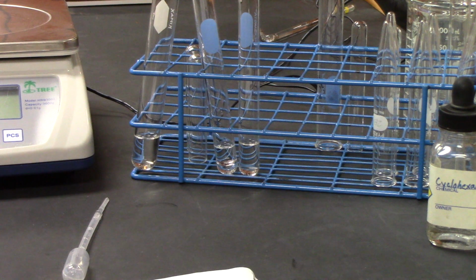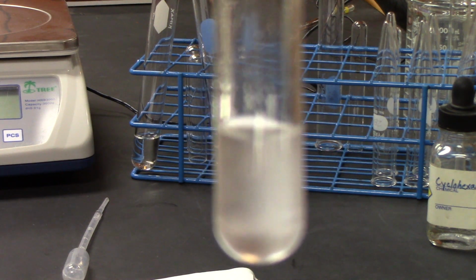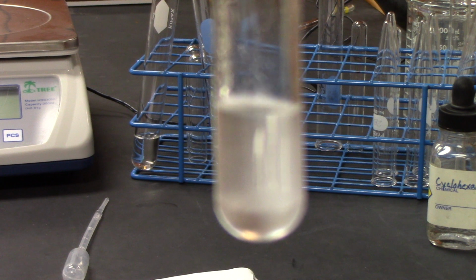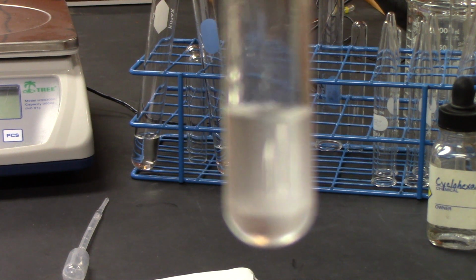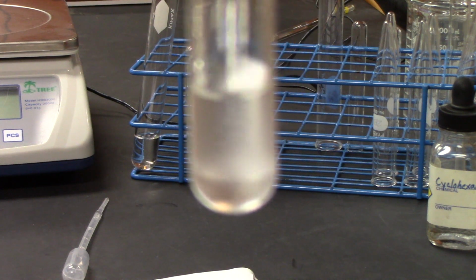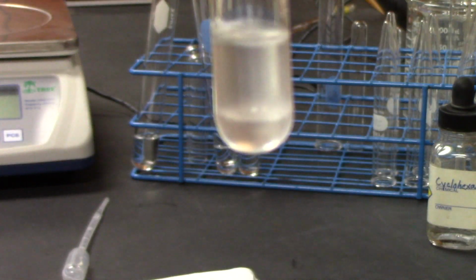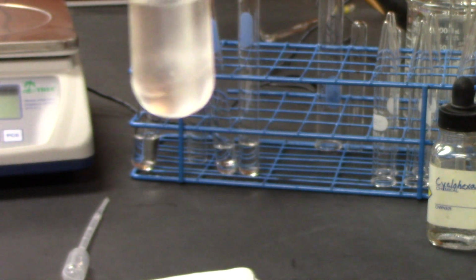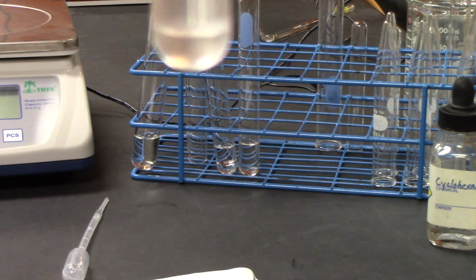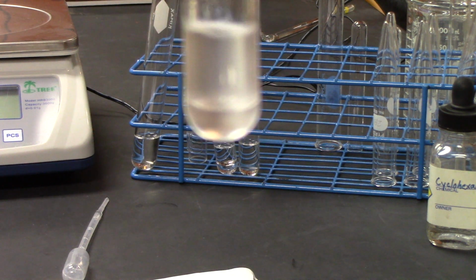And then finally, the third one, okay, I just shook it up. And if you can see, it's cloudy, okay? Now, if I leave this for a second here, let's see. Well, it looks like there could be a layer.